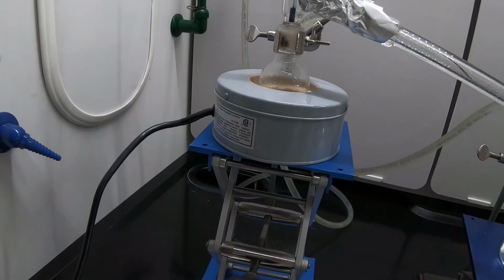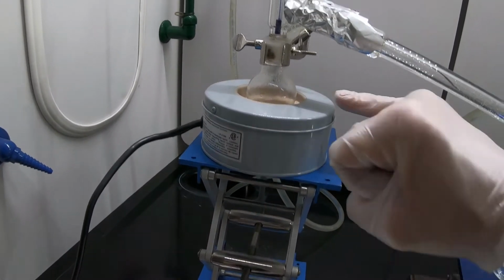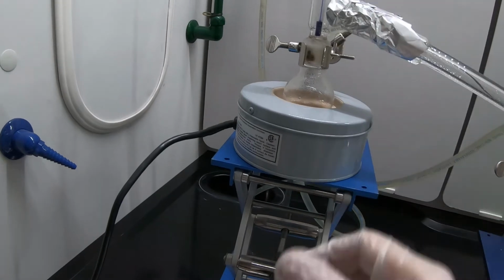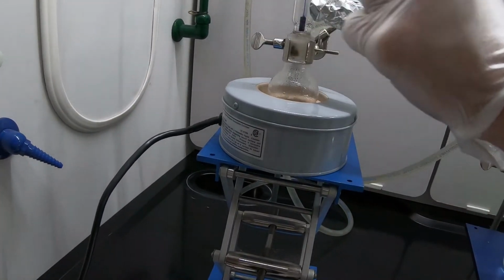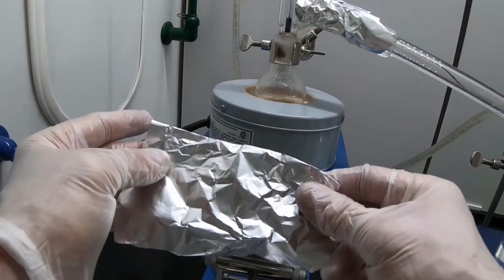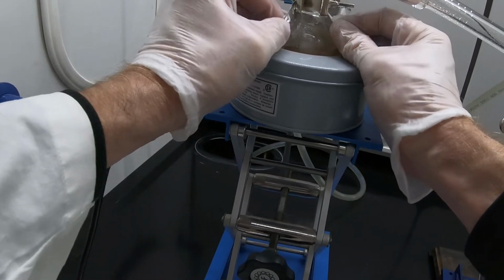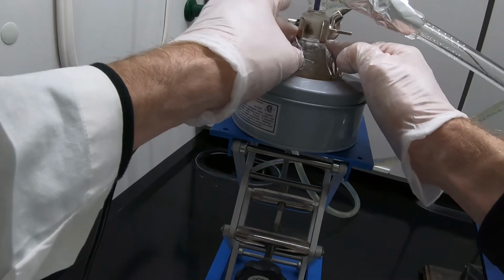Now we're going to hide the flask here with the tinfoil, but I'm just going to point out to you now that there is slight discoloration happening. There are some side reactions in this lab. Alkenes form, alkenes will polymerize with acid, and they'll form darkly colored compounds. We fully expect, especially from experience, that this will get darker and darker and darker. However, we do still expect a fair amount of product to be formed. The moment it's formed, it will distill over and we'll collect it there. However, side reactions are absolutely expected in this lab, and we'll take indication of that by a strong discoloration. More on that later.